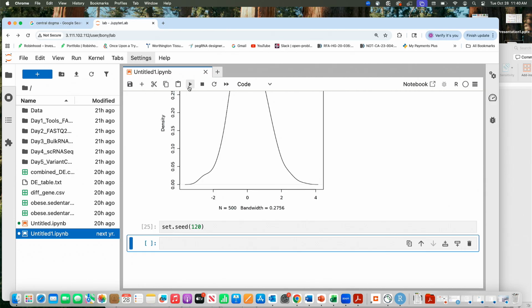Francis, do you want to explain what this seed does? So a computer scientist can tell you better than I do. But the random generator uses a seed to generate a random number, right? So you can set a specific number for the random generator. Even for single cell, any R code, you start with a seed and then define the number. It can be anything, but that is the number you should use always.